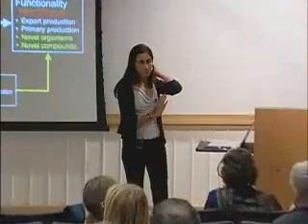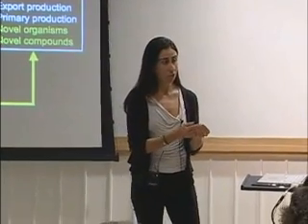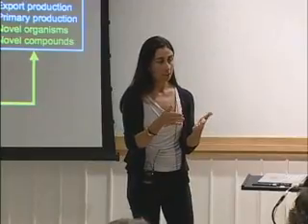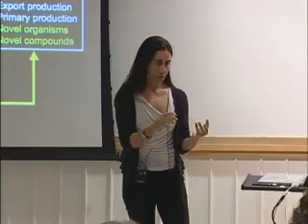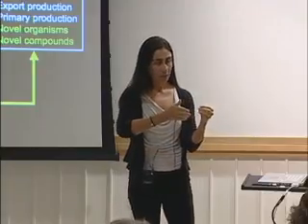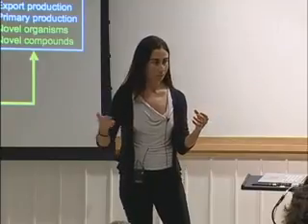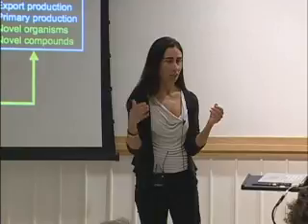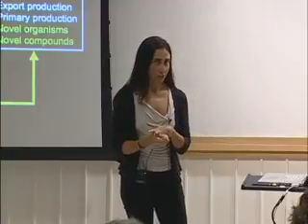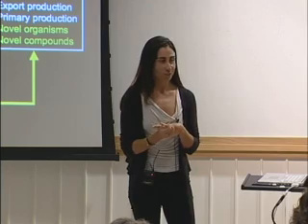We have a similar problem with larvae of echinoderms. If you are doing an incubation experiment and you spawn the larvae and then you look at fertilization, and you follow the larval development up to metamorphosis, for example, you have to ask yourself, is this okay? When you see high mortality, you probably have to stop your experiment. I don't have a clue about how to grow pteropods in culture.